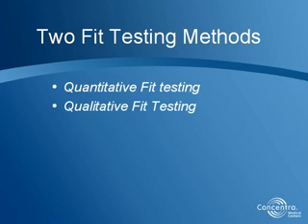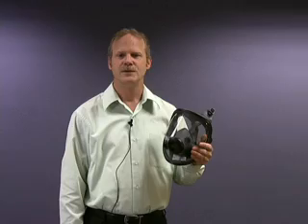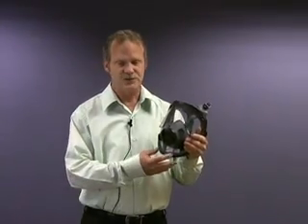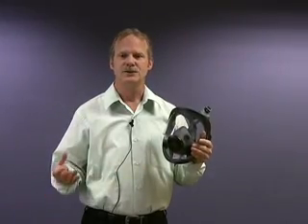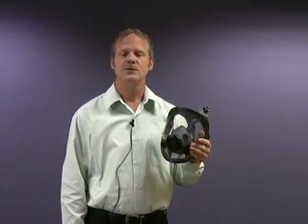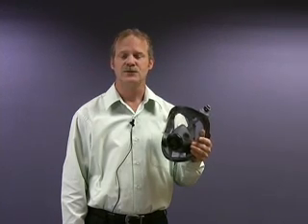This video will be covering OSHA's regulations on fit test procedures using the qualitative fit test method. There is another method that is approved called the quantitative fit test method. This type of method would require a PortaCount instrument that actually adapts this mask to hook up to an instrument. It checks the particles inside the mask as well as the particles outside the mask. Prior to performing this fit test method, you would still need the PLHCP, or physician or licensed healthcare professional's written statement of opinion determining whether this person is medically qualified to wear the mask.